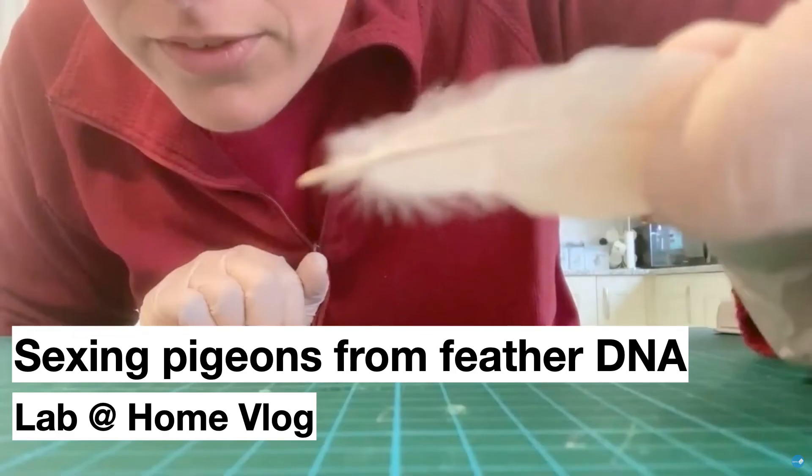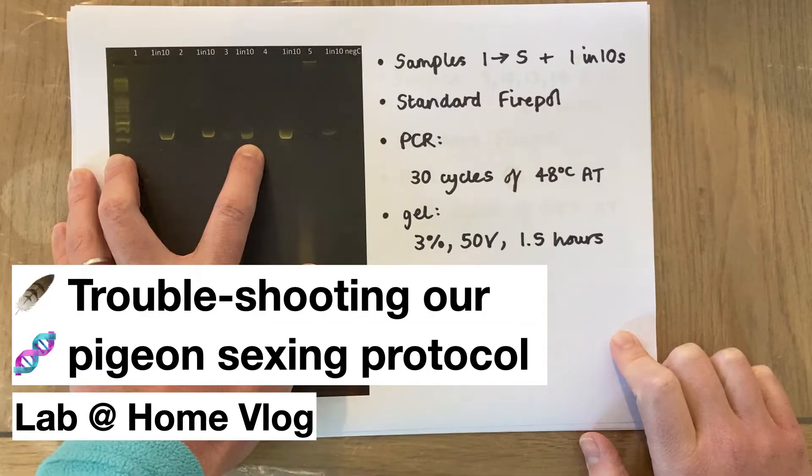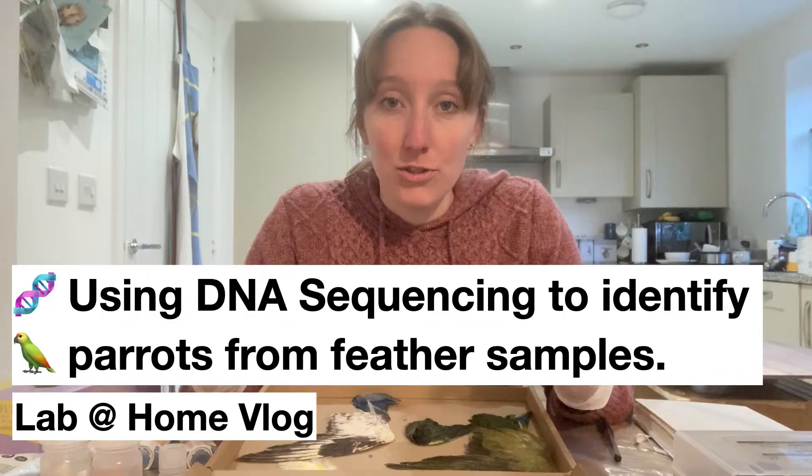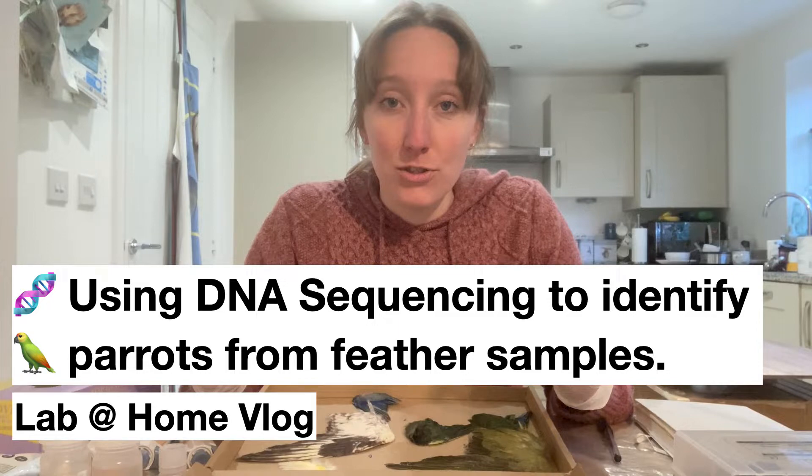I then extracted DNA from pigeon and parrot feathers sent to us from our collaborators, and was able to find out the gender of the birds those feathers were plucked from, which is really important for breeders and conservationists working on monomorphic birds. I also extracted DNA for our barcoding workflows, and I was really impressed how well those DNA barcodes amplified and how accurate the sequences were when I sent them off to the sequencing facility for Sanger sequencing. That was probably my favourite workflow to test because it really shows you the complexity of DNA analysis and how it can play such an important role in scientific discoveries.